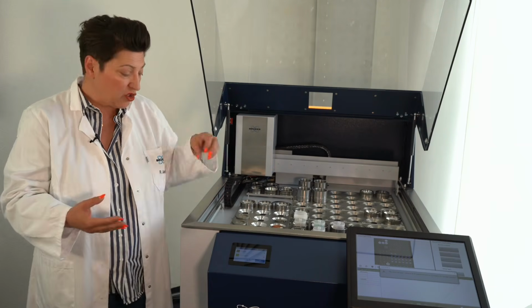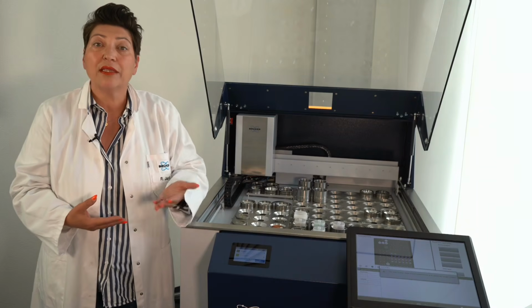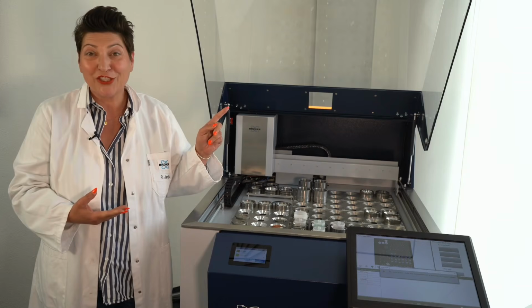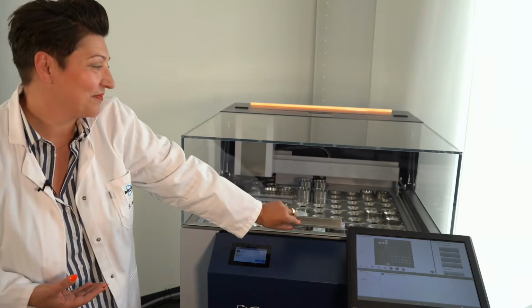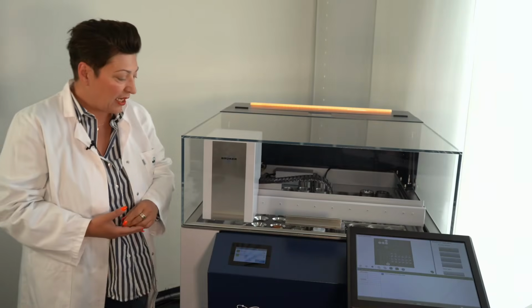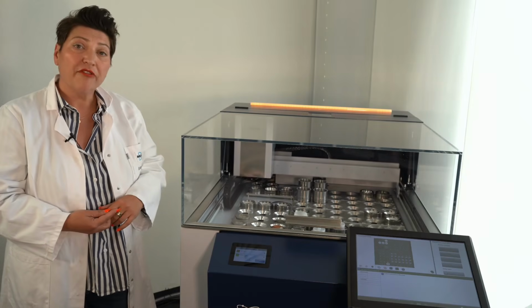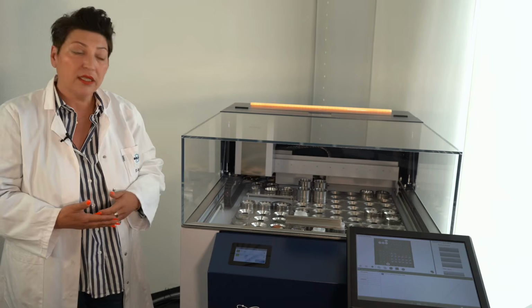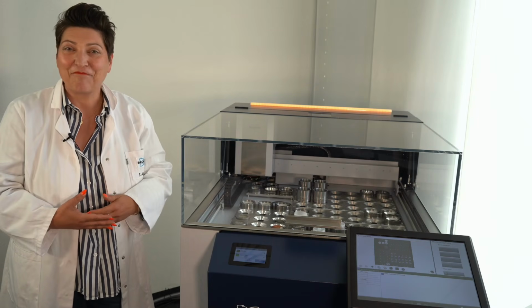So this means as soon as a sample is loaded into position, the camera will detect that the sample is loaded, and then automatically the measurement is started, which was defined by the customer. I will just show this by closing the lid. So now the camera will check the automatic position, which was defined in front of the tray, and as soon as the sample is loaded, it will start automatically. In this case, no sample is loaded, and so no measurement is started.